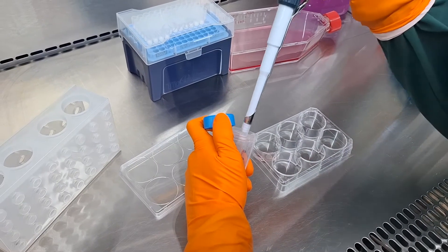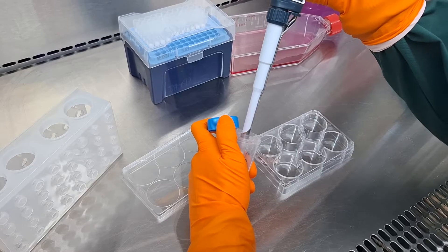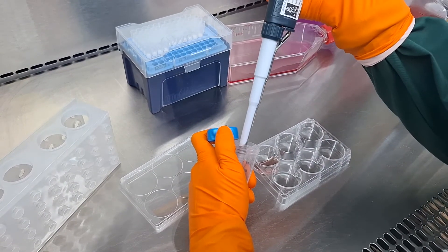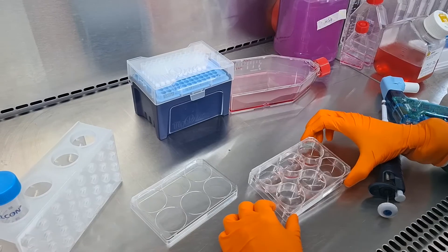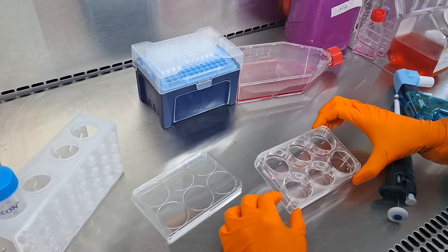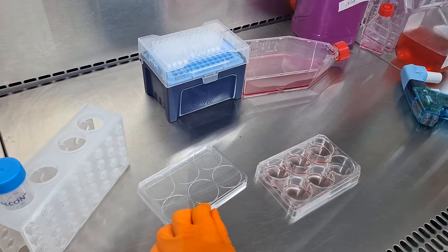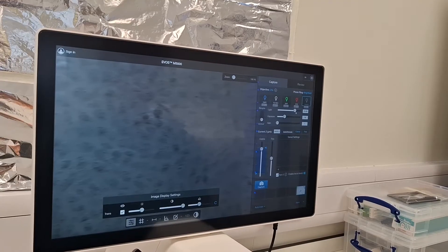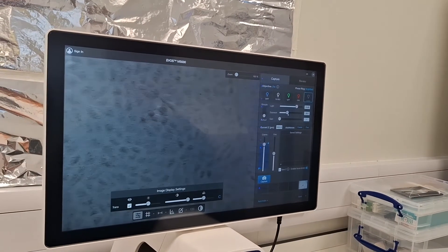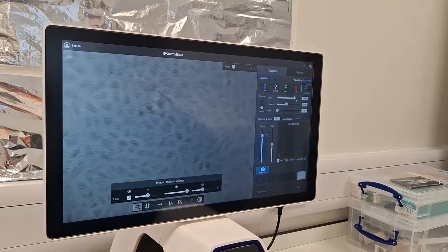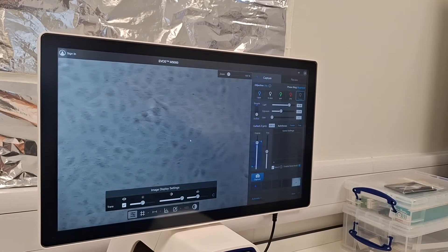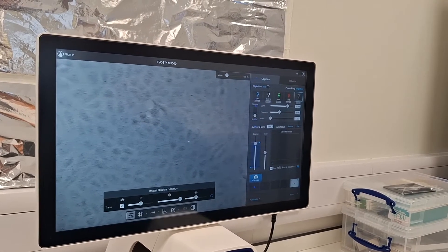Let's go through the steps of performing a plaque assay. First, we need to grow the cells until they form a confluent monolayer of susceptible cells. This means cultivating the cells so that they uniformly cover the entire growth surface, forming a cohesive sheet that's susceptible to the virus we're studying.